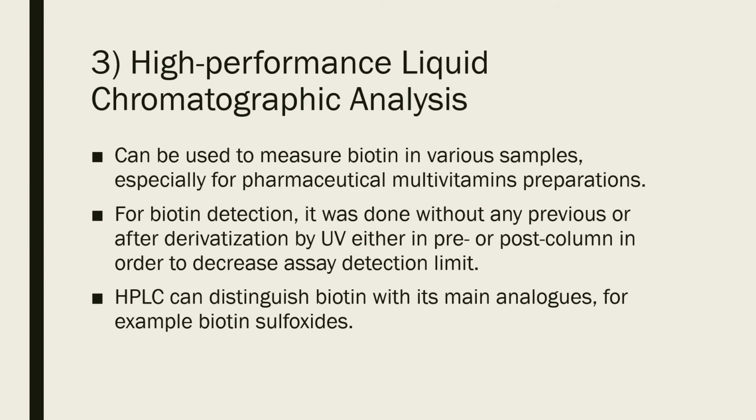Biotin detection was done with or without derivatization by ultraviolet UV, either in pre or post column, in order to decrease assay detection limit. Assay detection limit refers to the lowest concentration that can be distinguished from baseline. Thus, HPLC can distinguish biotin from its main analogues, for instance, biotin sulfoxides, sulfone, and others.